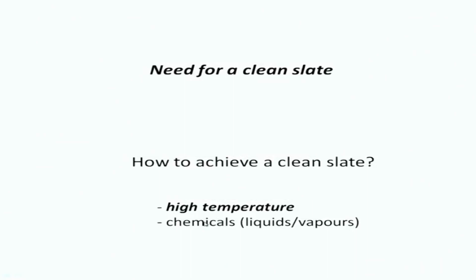No vapor is allowed to escape outside the lab, and the lab is kept sealed for a couple of days. Then when you enter, you can actually smell the cleanliness, the lack of organisms in the lab, along with the chemical smell. So, this is a very common procedure for using chemicals. In this case it was formalin. You could also use 70% ethanol to kill the organisms on your hands, on your gloves and so on, while working with organisms, while transferring organisms from one place to another in a lab.